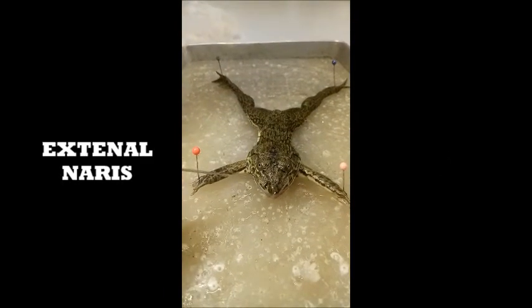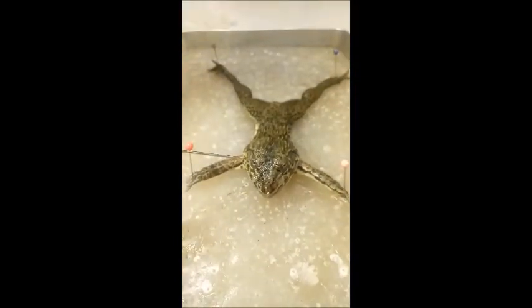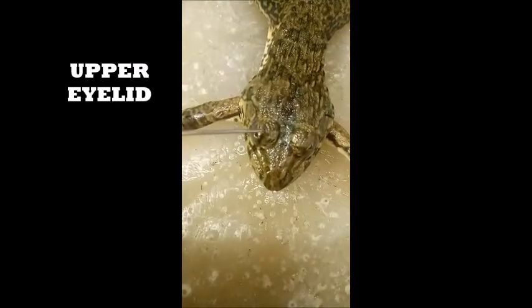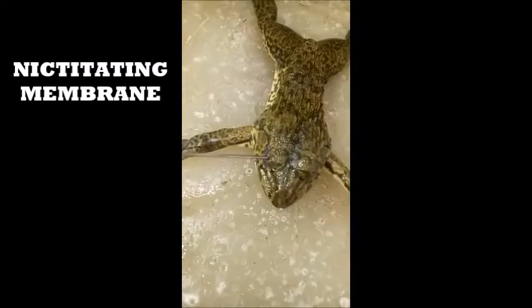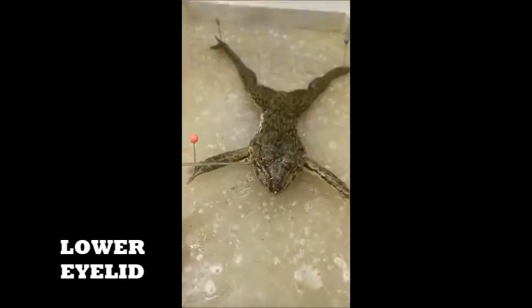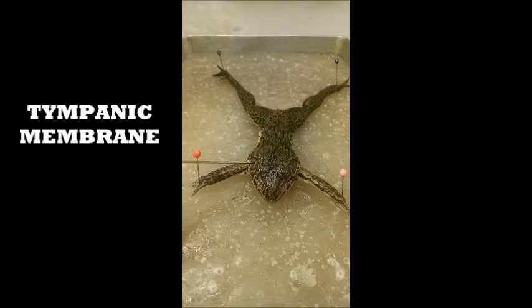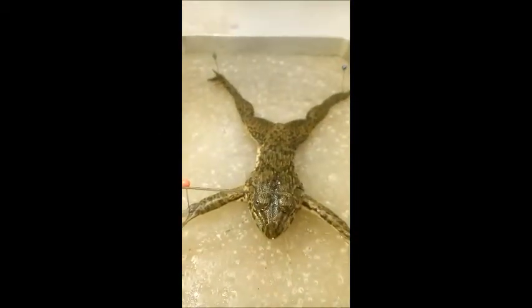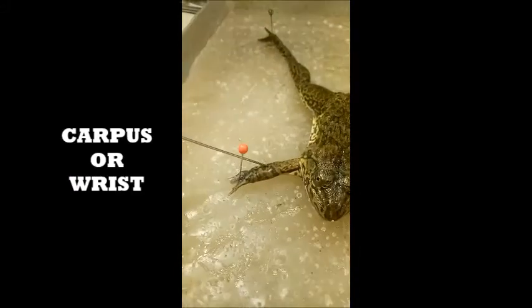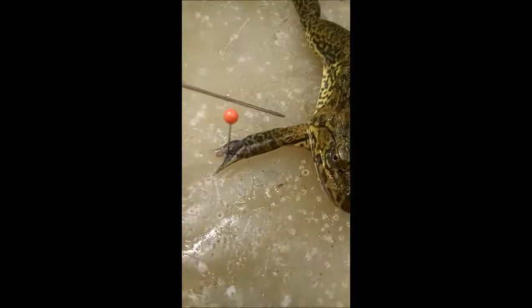Now, external anatomy. The upper eyelid, nictitating membranes, tympanic membranes, carpus — these are key structures visible on the exterior of the frog.